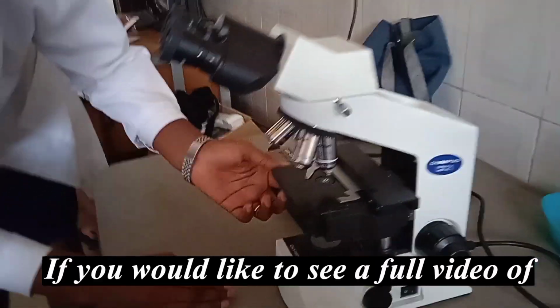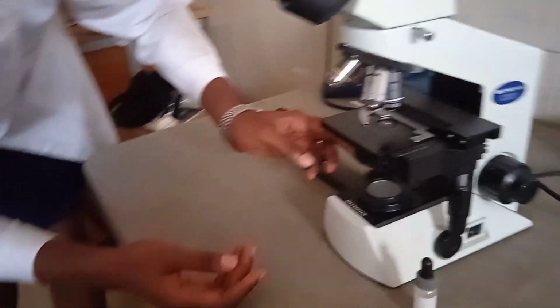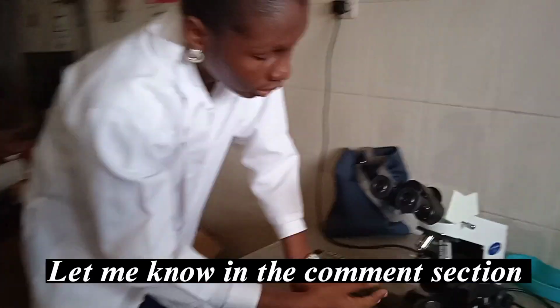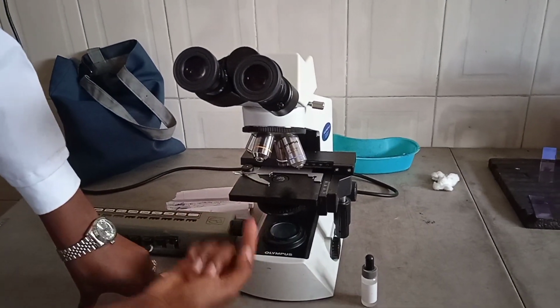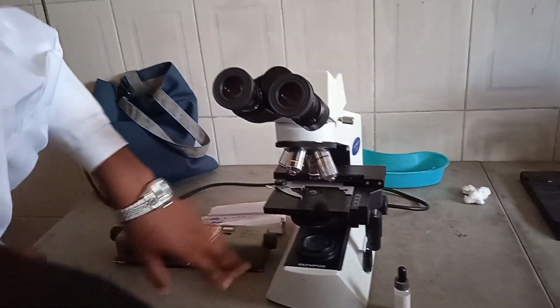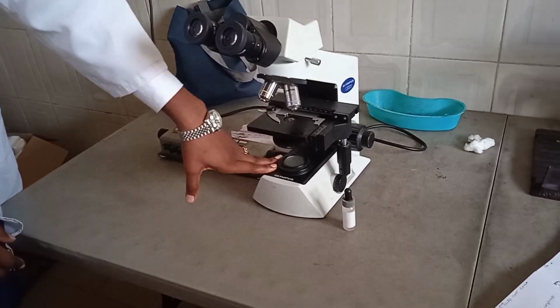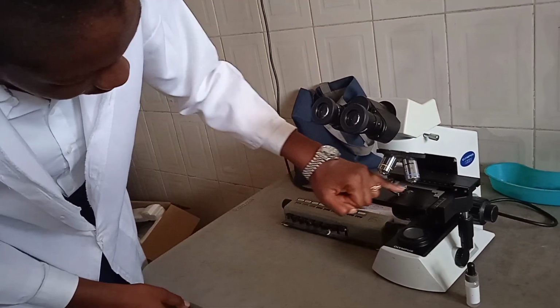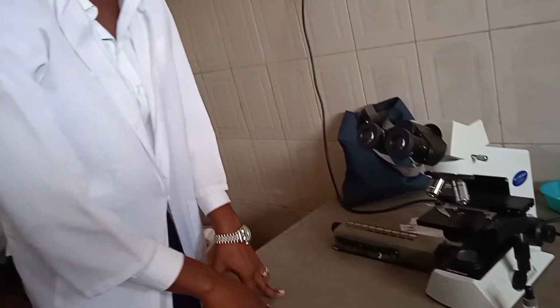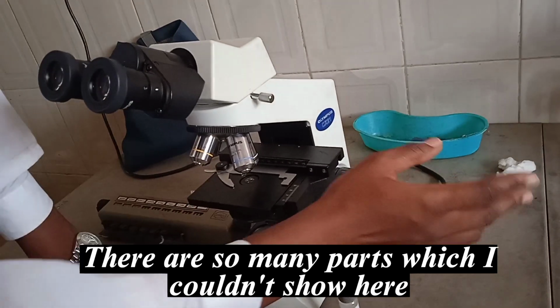So he said this is the diaphragm, or the iris diaphragm. The diaphragm helps in the adjustment of light, the light that passes through the condenser. There is a condenser here. This condenser allows light, and this is the light source. When the light comes in, it passes through there, and it's called the condenser. So this is the coarse adjustment and the fine adjustment.